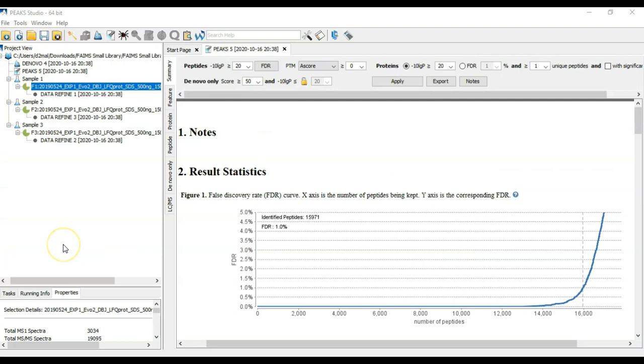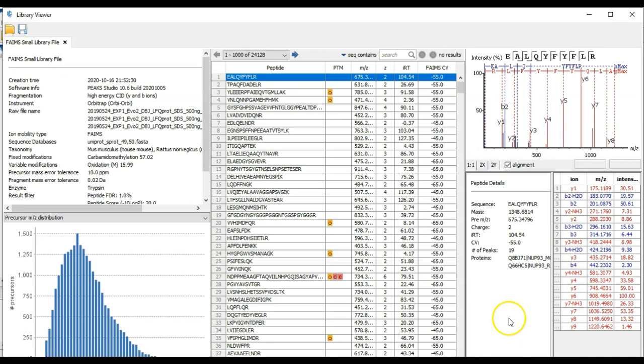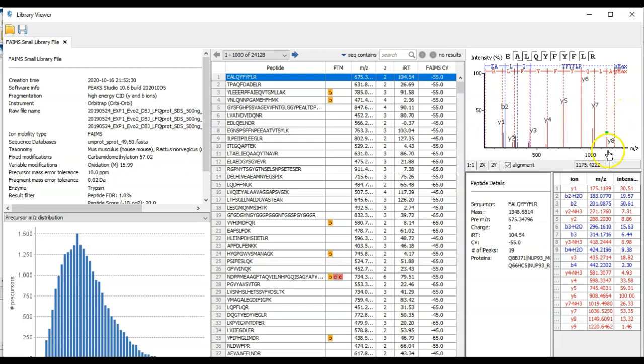In PEAKS, you can actually bring in any text format library with the library viewer. Then open, and here you can view the details of your library. Where you can see all the peptides, some different statistical charts, the annotated spectrum of the library peptide, and the matched ions.